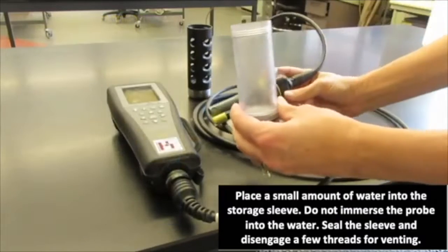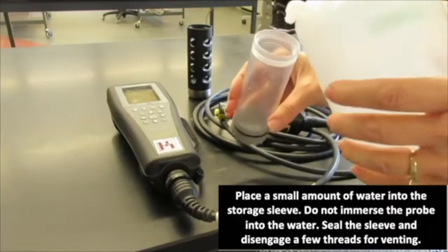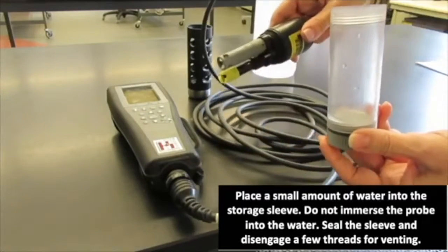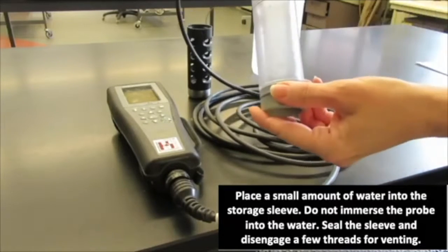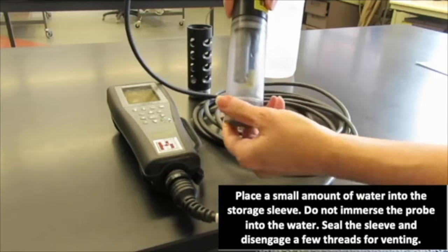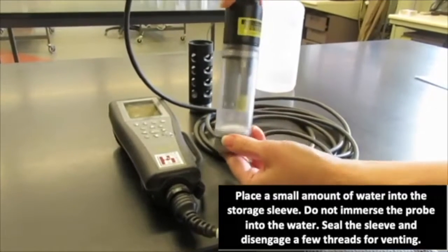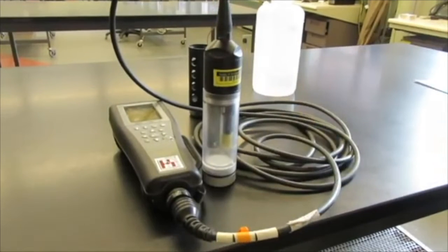What we will do is add a little bit of moisture into the storage sleeve. We want to make sure that our probes are not immersed in this water, and we shake off a little bit of the water droplets. Screw on this plastic sleeve tightly and then disengage a couple of threads, which will allow for atmospheric venting.